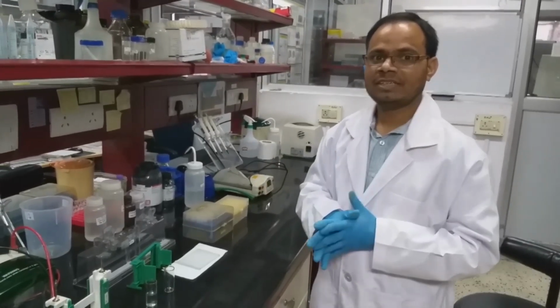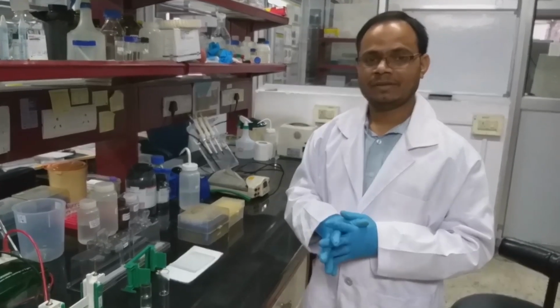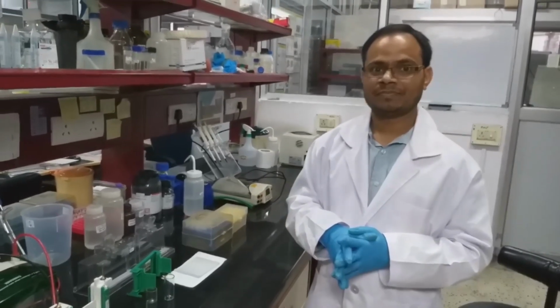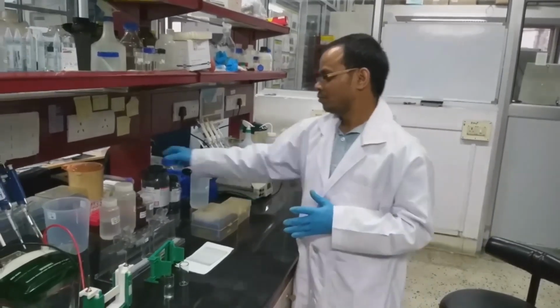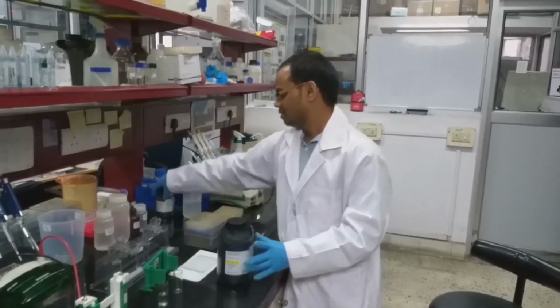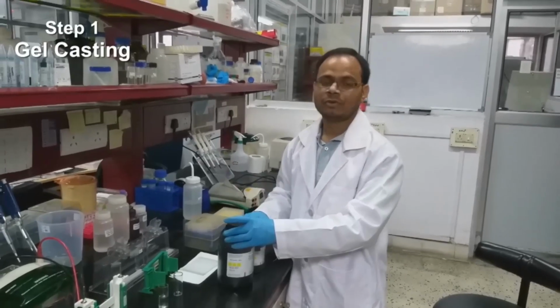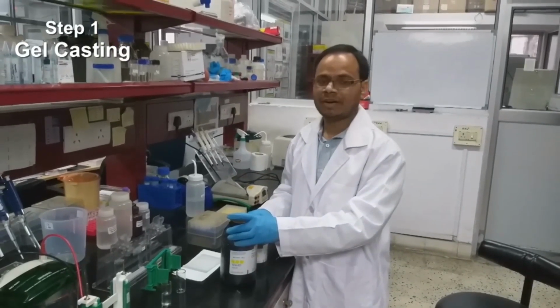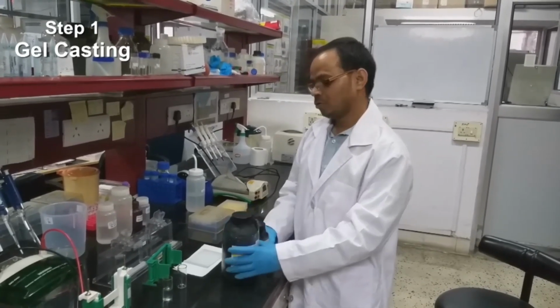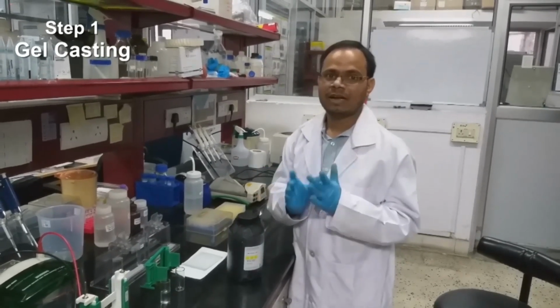The first reagent we need for this experiment is acrylamide. Generally we will prepare 30% acrylamide. 30% means 29 grams of acrylamide and 1 gram of bisacrylamide. We use both in a 29:1 ratio in 100 ml of water to get 30% acrylamide. Both of these are neurotoxic, so we have to wear gloves always.